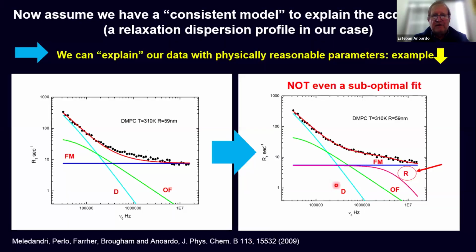This is about the problem. Now assume that we have a model that we validated on our data. What does this mean? This means essentially that we can explain with our model the information we have collected with the machine. Essentially, there is no fitting here, just testing. We get information about the physical parameters from other techniques.